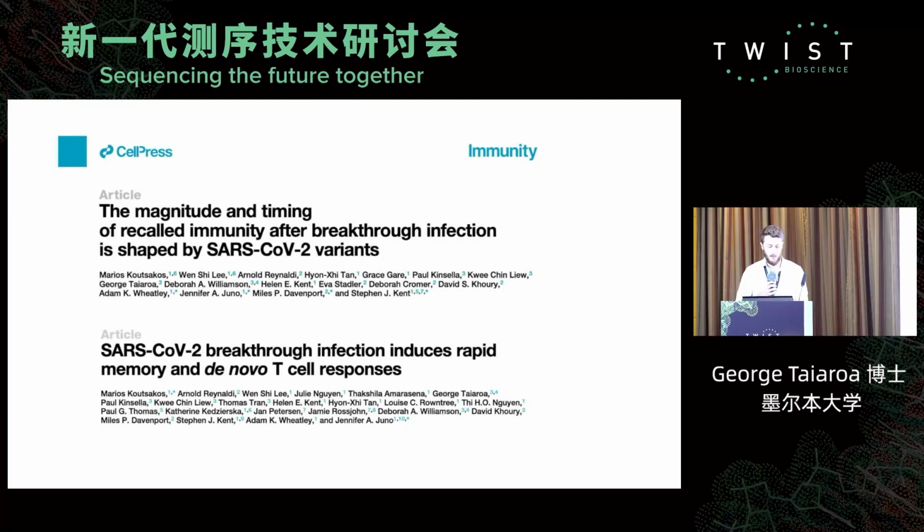So these are two papers that we've been involved in, both published in Immunity, which are looking at different SARS-CoV-2 variants, which we didn't use culture for, we just used culture-independent methods. And both of these papers are around guiding how vaccines are going to work long-term for COVID. So really useful, not just for the very pointy end of public health, but useful throughout the entire developmental pipeline.